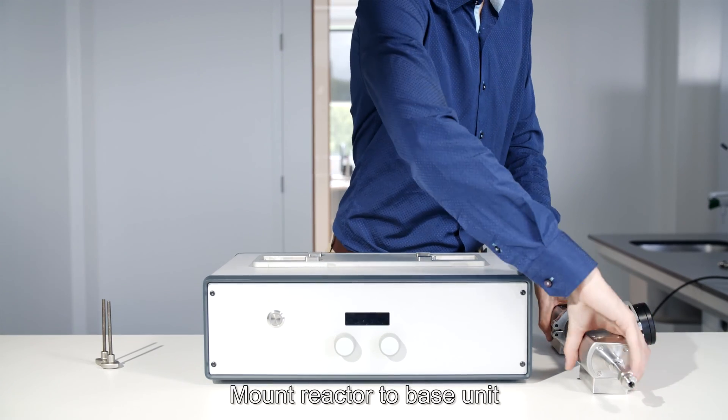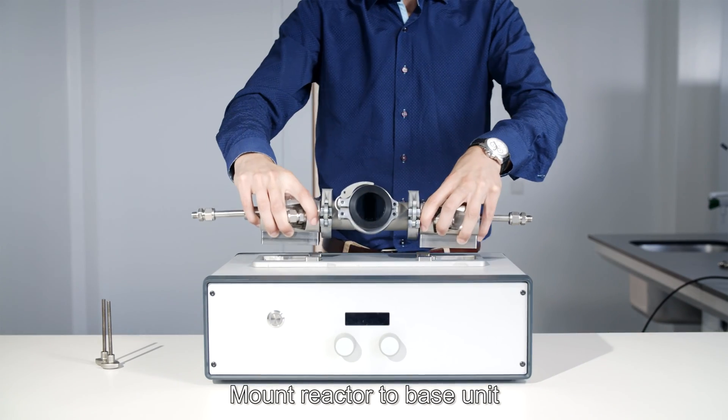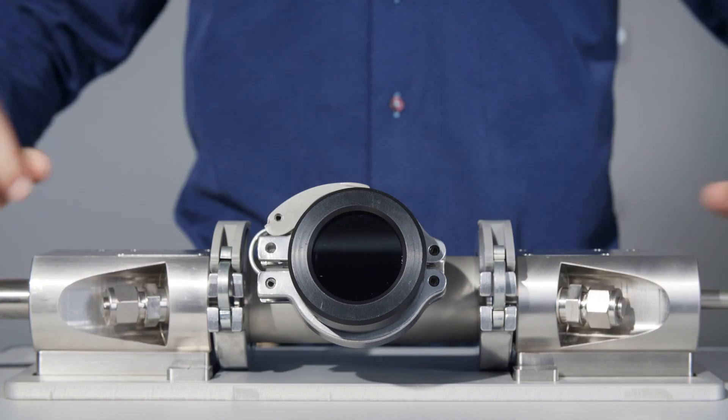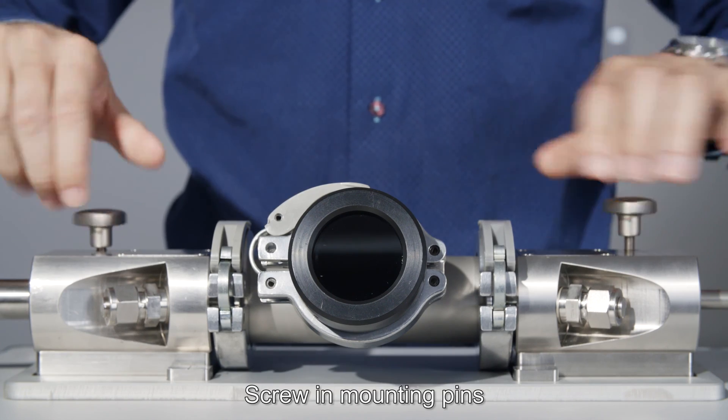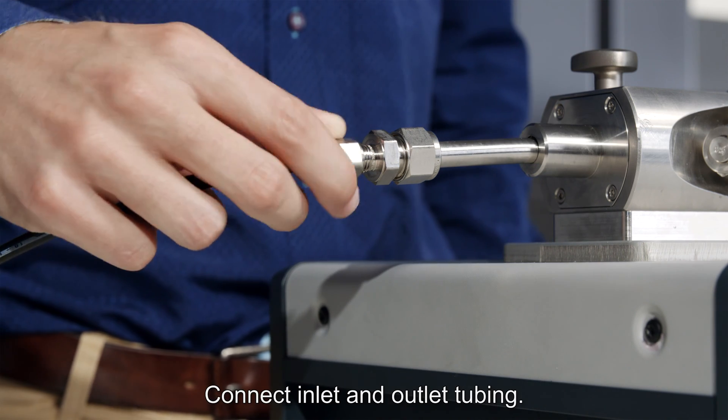Mount the reactor to the base unit. Screw in the mounting pins. Connect the inlet and outlet tubing.